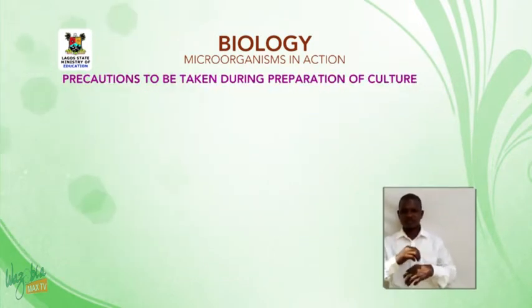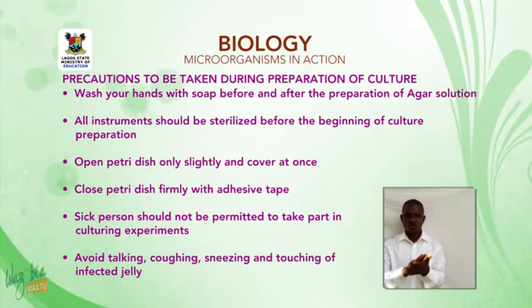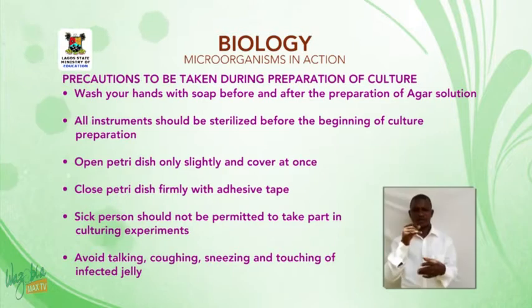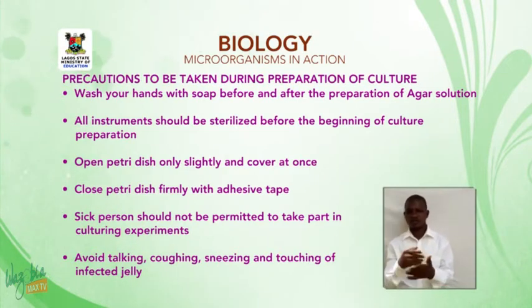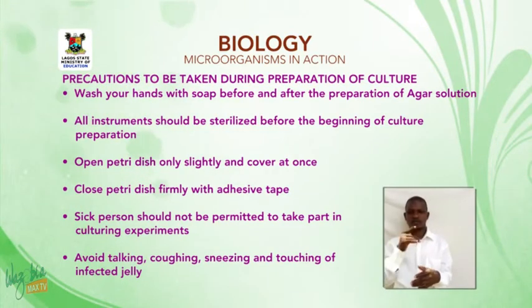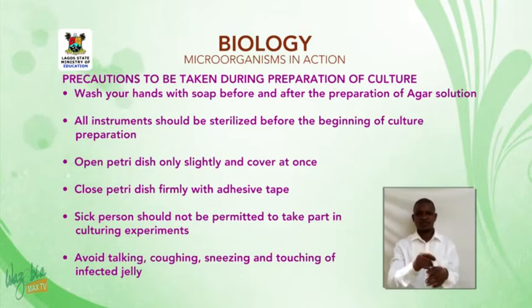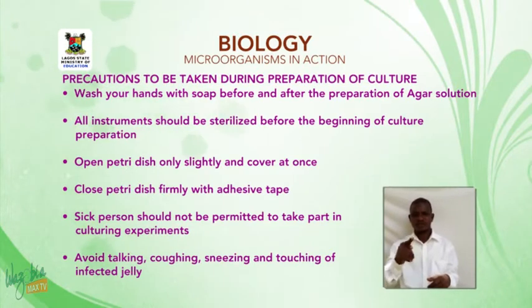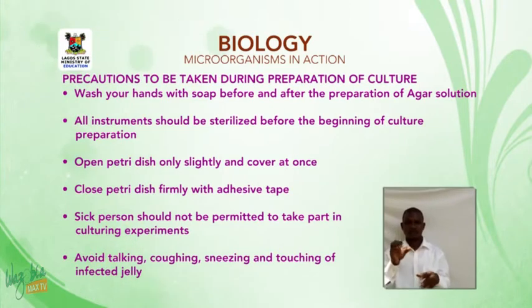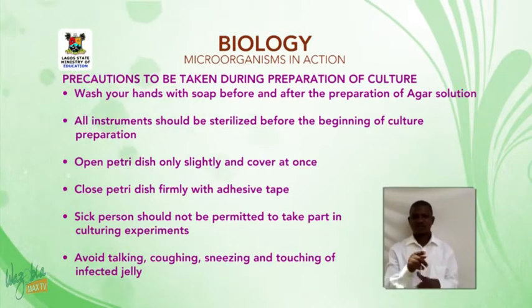Precautions to be taken during preparation of culture. Wash your hands with soap before and after the preparation of agar solution. All instruments should be sterilized before the beginning of culture preparation. Open petri dish only slightly and cover at once. Close petri dish firmly with adhesive tape. Sick persons should not be permitted to take part in culturing experiments. Avoid talking, coughing, sneezing, and touching of infected jelly.